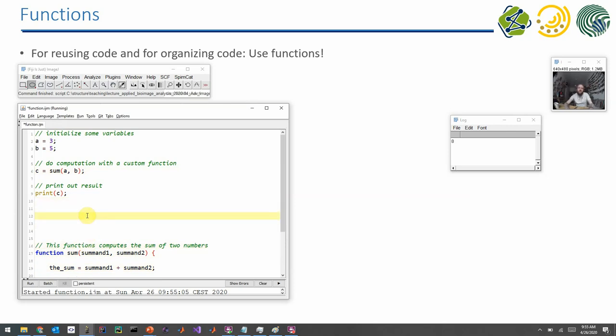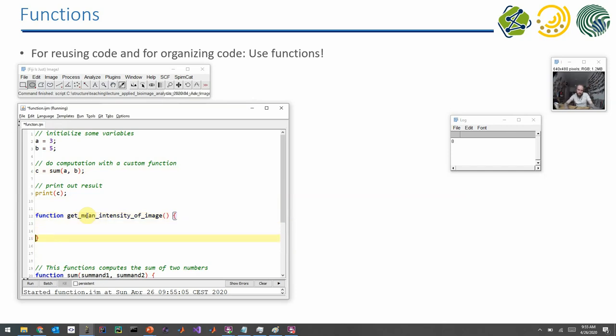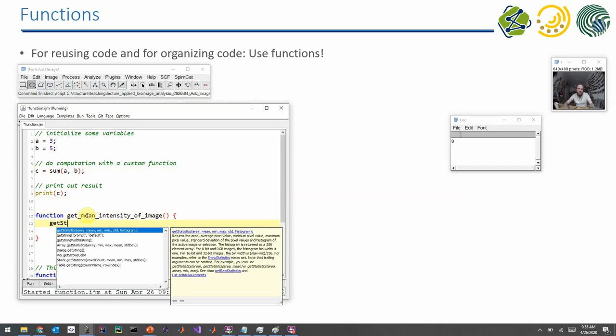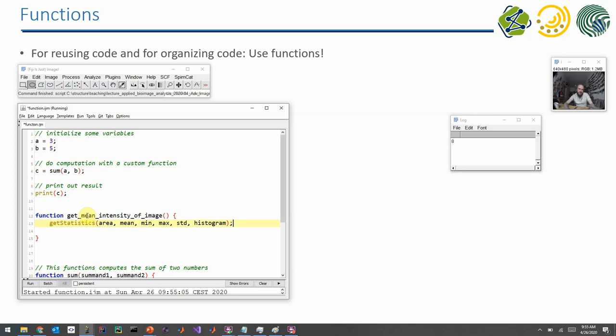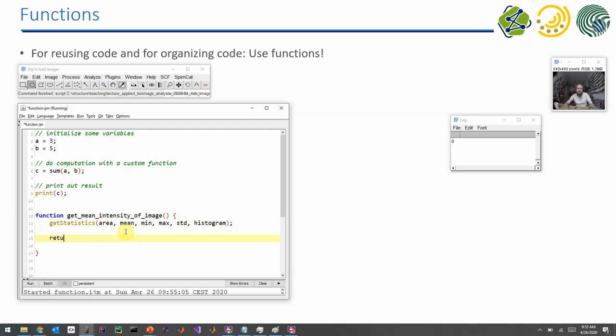But what you can also do is you can define the function for particular purposes, like doing the following: get mean intensity of image. And then you call the get statistics command. That's a different function. And it delivers, among other parameters, it delivers the mean. And then you can return the mean value. You can in functions also apply a threshold, apply a Gaussian blur, count the number of objects, and then return the number of objects.